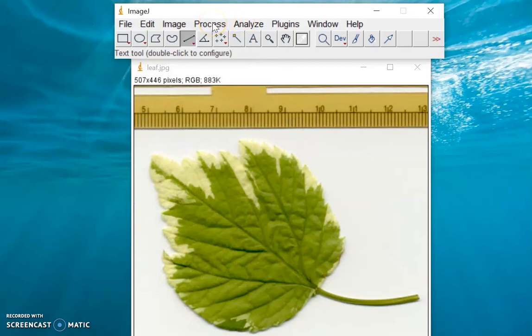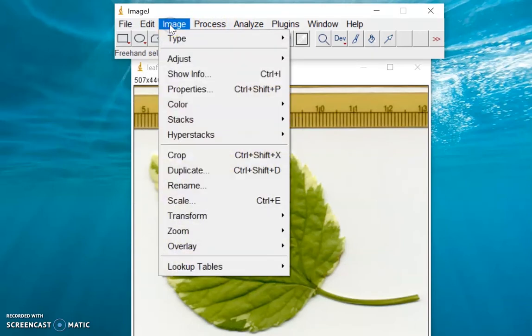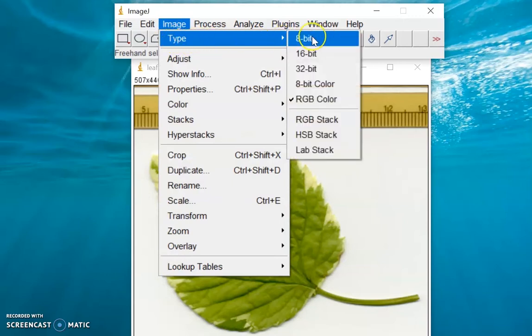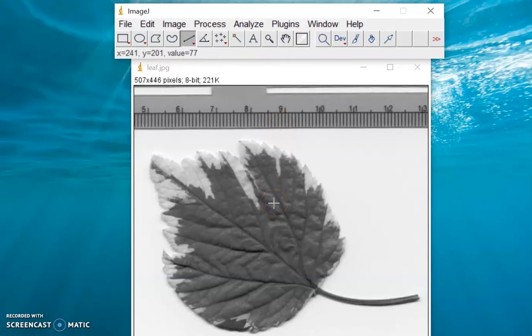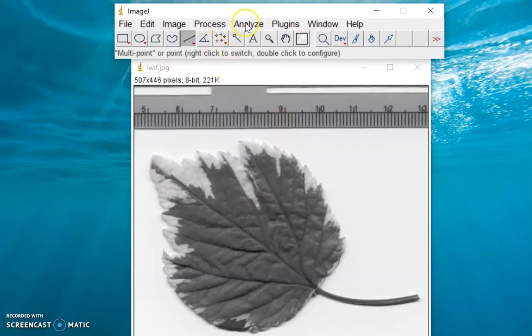What we can do is go to Image, then click Type first and let's convert this RGB image into an 8-bit image. So we now have an 8-bit image.